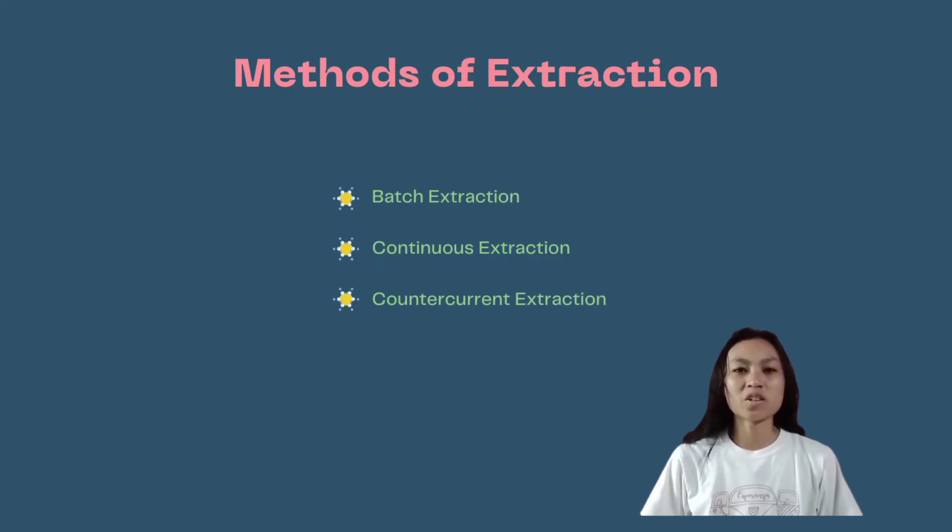There are three methods of extraction: batch extraction, continuous extraction, and countercurrent extraction. These three basic methods of liquid-liquid extraction are generally utilized in the analytical laboratory.